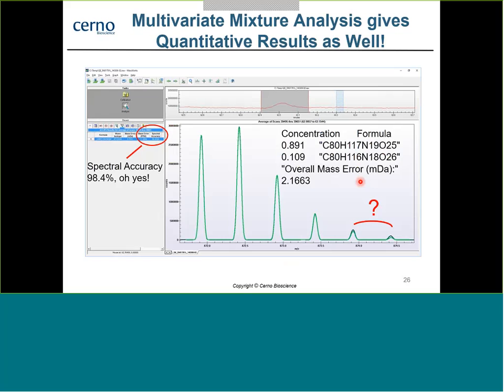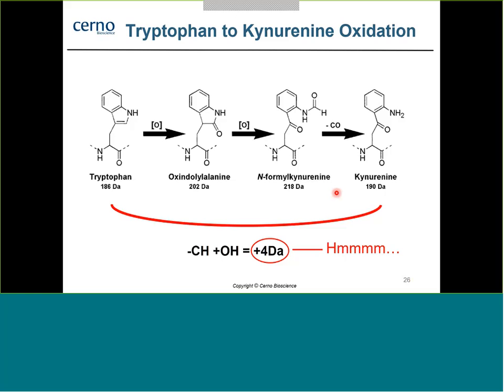And if we go back here, you'll see that this is actually done at charge 2, so this is actually only half a step or half a Dalton. But you can see here at the A+4 peak, indeed, that's where the error starts to show up. So that's a good indication, okay, that maybe this is a potential interference, another degradation product.